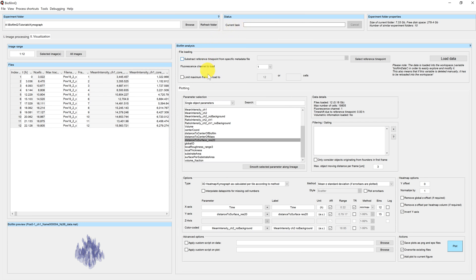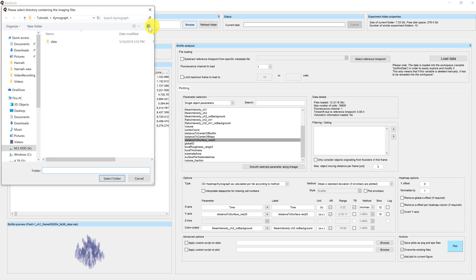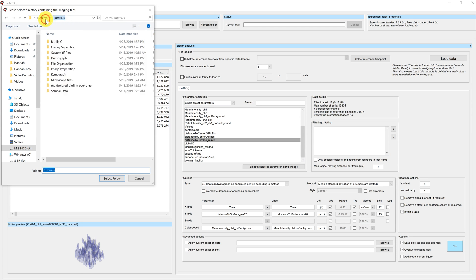Now we want to do demograph plotting. A demograph is similar to a kymograph, but we will not look at a time series, but instead we will look at different positions corresponding to different conditions. I have prepared a directory here, which I will load now.